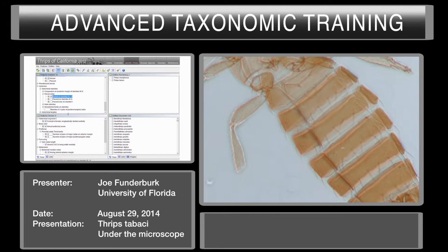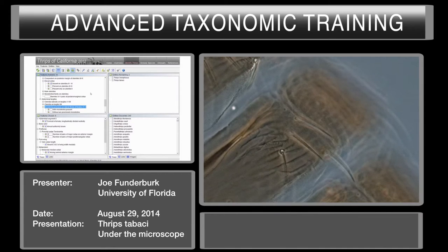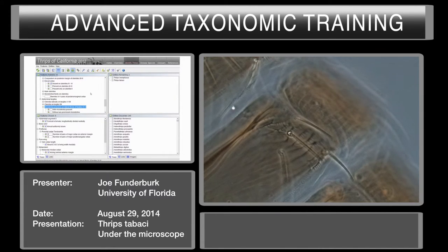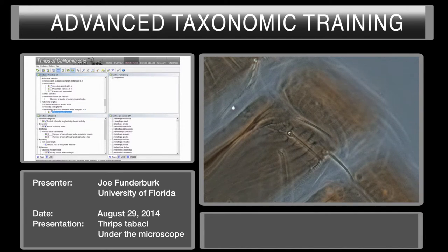We're down to two species. Now I go to the next best character: microtrichia presence on lateral thirds of tergites four through six. Very fortunately, we're already in that area. You can see this is a tergite, and here on the lateral thirds of the tergite you can see these rows of microtrichia. Very clearly — Thrips tabaci remaining.